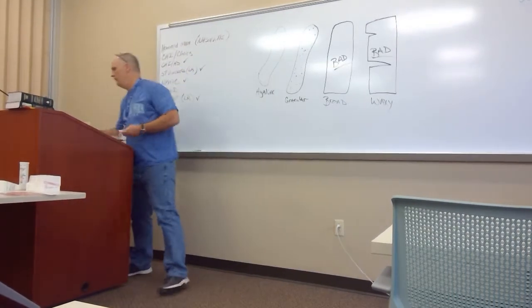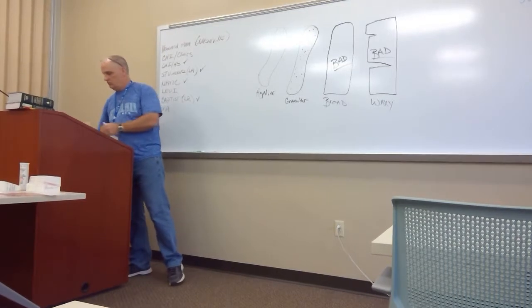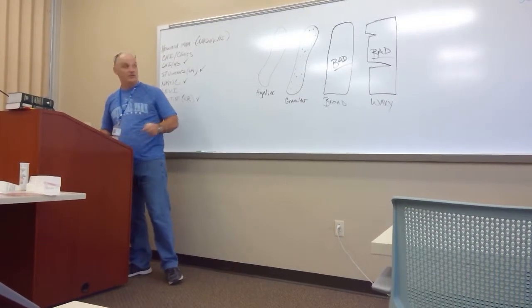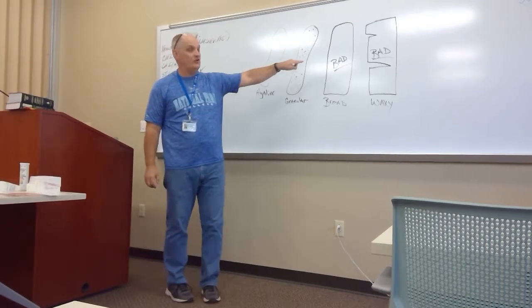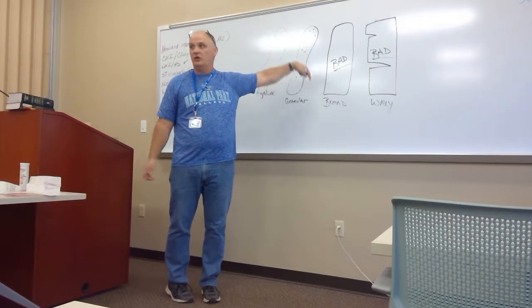This is the one that I was telling you about, that you view these under low power, okay? Because they're so big, you don't want to view those under high power.